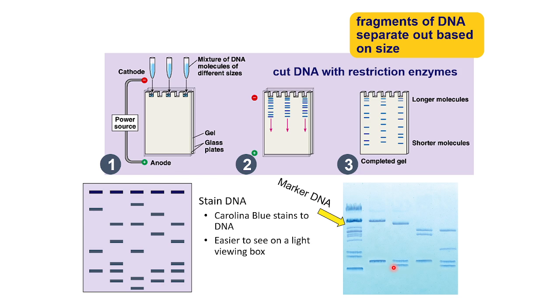You can tell that yes, my cut has occurred at the right place, and if it's cutting at 1500, you're supposed to get it somewhere like this. You can tell that yes, this is also the desired region, because this marker DNA is probably of the size of 2000 base pair, right? So that is the molecular weight or base pair indicator that you always run whenever you're running an agarose gel or an SDS-PAGE.